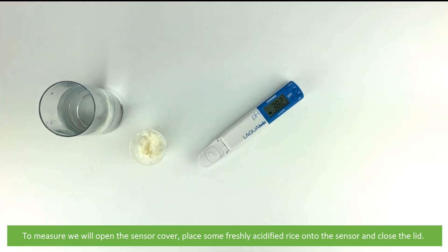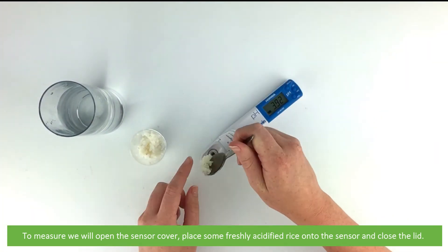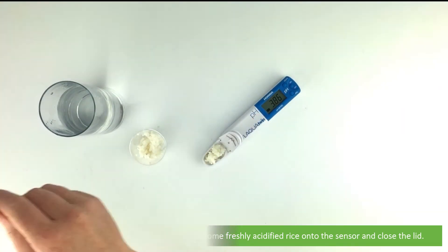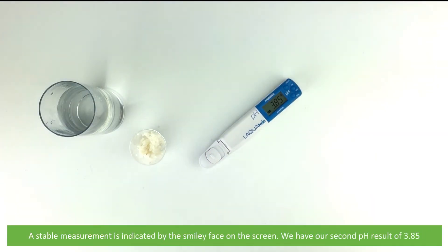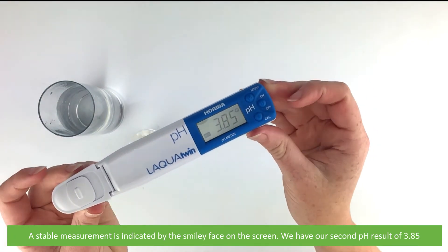To measure, we will open the sensor cover, place some freshly acidified rice onto the sensor and then close the lid. A stable measurement is again indicated by the smiley face on the screen. We have our second pH result of 3.85.